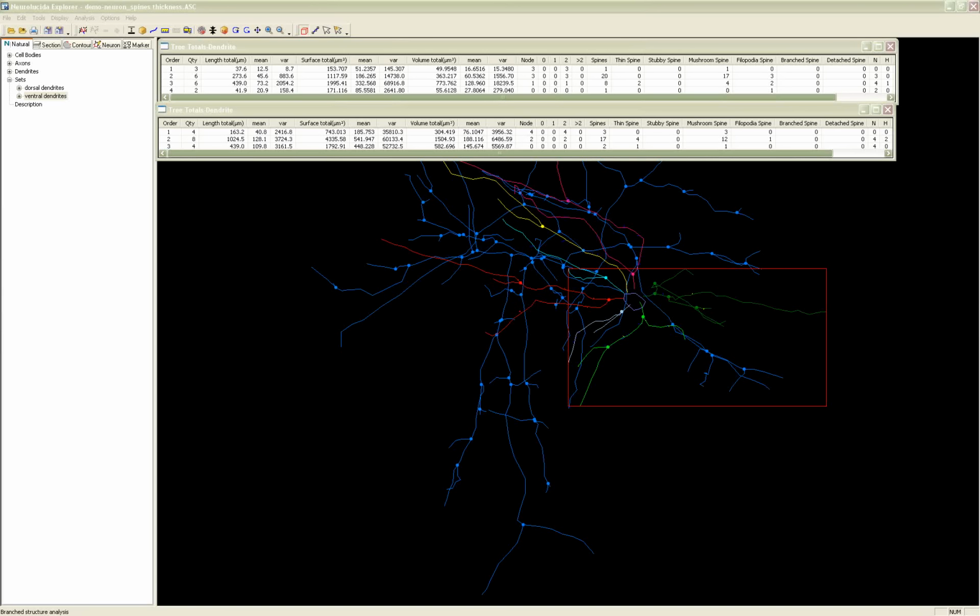Chandler asks, if you alter the thickness of the cursor while tracing, when you visualize the final reconstruction, will your model reflect the dendrite thickness of your tracing, or is that thickness selection just something you might do to help you perform an accurate dendrite tracing? Adjusting the thickness of the cursor while tracing allows you to approximate the thickness of the branch as you see it, and you can export that volumetric information.